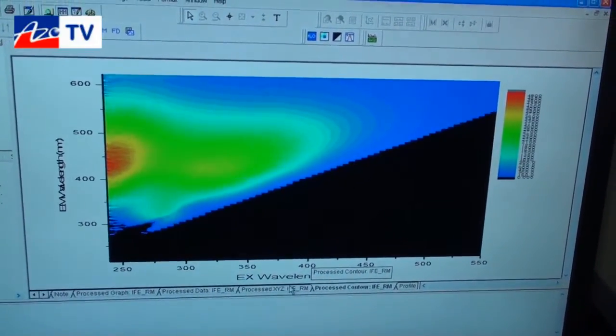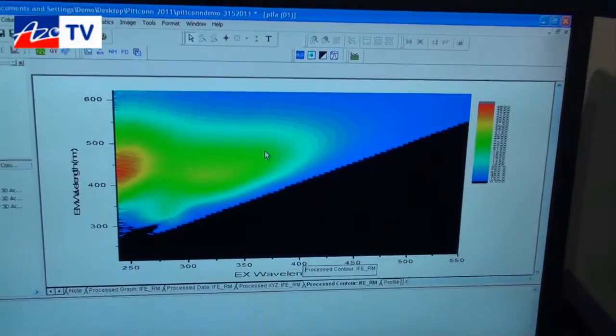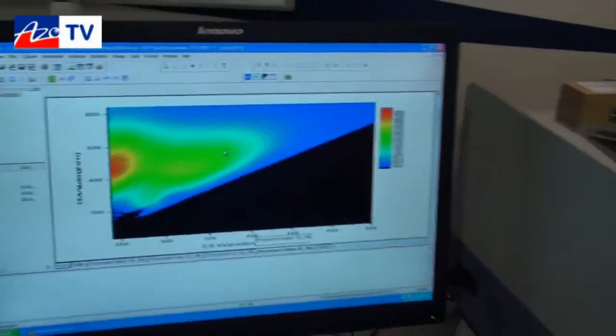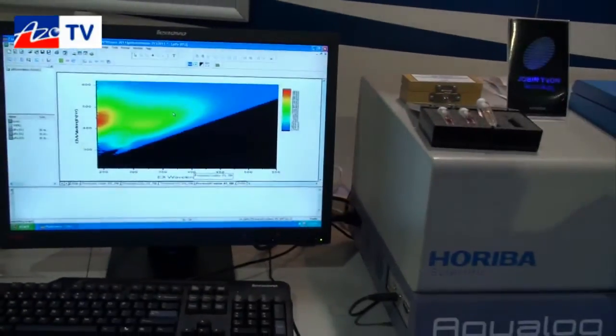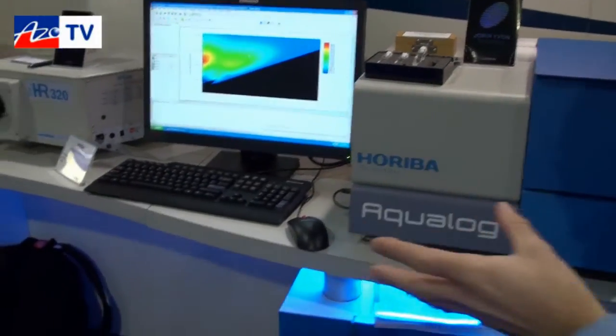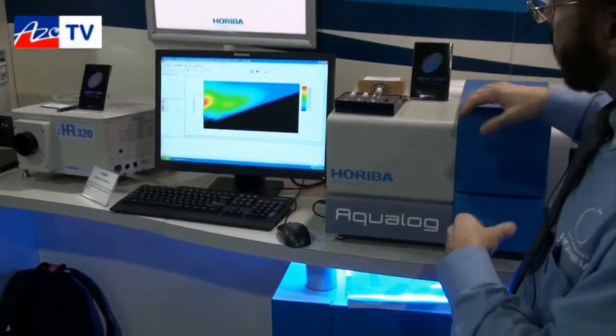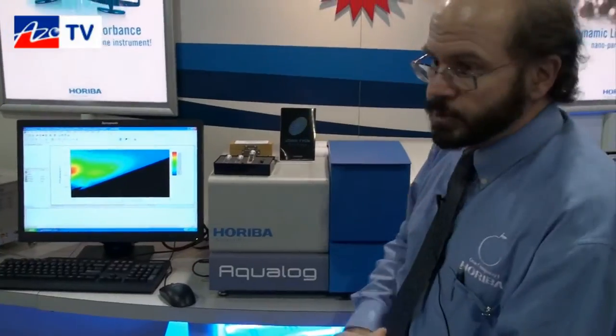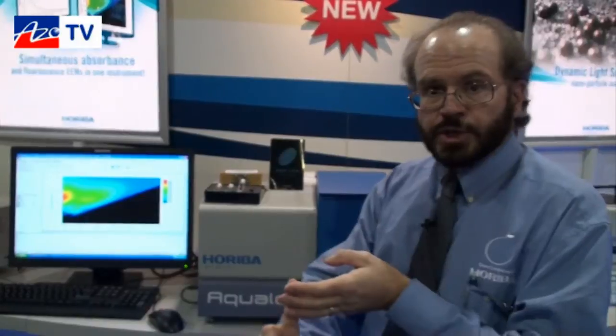So again, just as an overview, this is the first system to do true simultaneous absorption fluorescence. It's the first system that uses a CCD so it can acquire data 100 times faster, and it's the first system that employs inner filter effect correction, Rayleigh masking, and normalization to quinine sulfate standard units or Raman scattering units for a quantitative analysis that allows you to do true validated inter-laboratory comparisons.